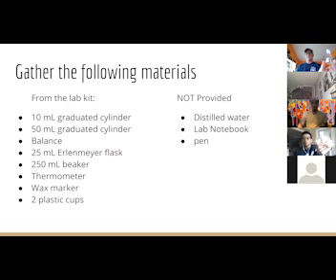It's one of these. So what's the difference between a flask and a beaker? So this is a flask. What's the difference between that and a beaker? How would I tell the difference immediately? Lance again's got the beaker out. What's the difference, Lance, between the beaker and a flask? With the beaker, it's not only bigger, but it also has the measurements on it, kind of like the graduated cylinder, so you're able to measure volumes of liquid in it as well.